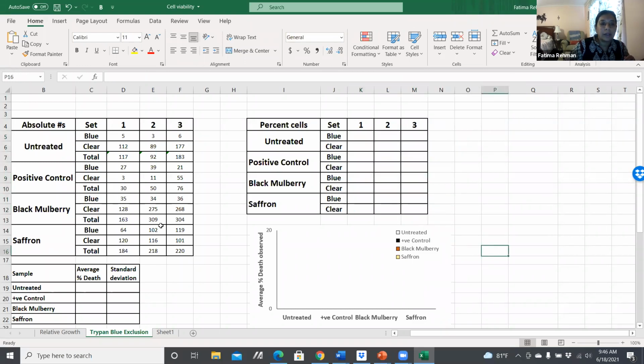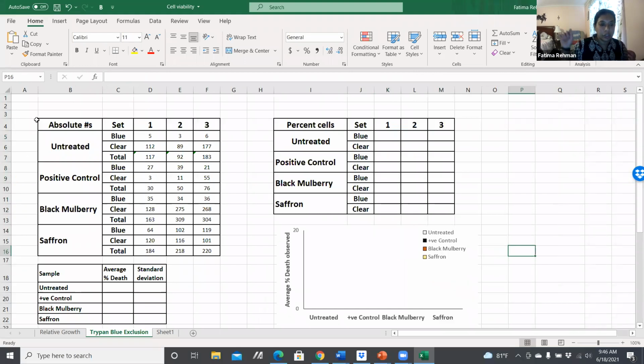Okay, I'll show that to you later. Like I said, all the graphs and tables in there are already set, so you can just click on that square and copy and paste them into the Excel document.